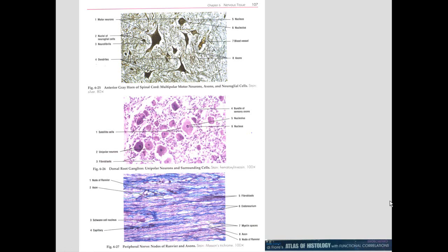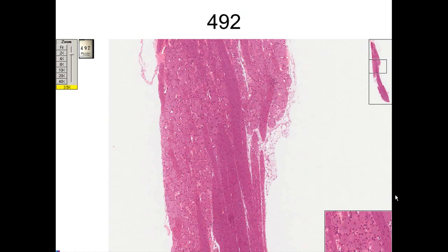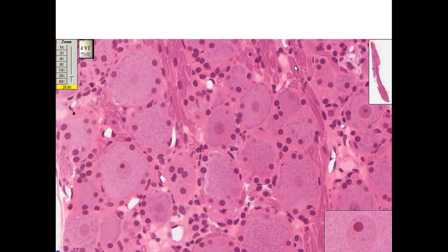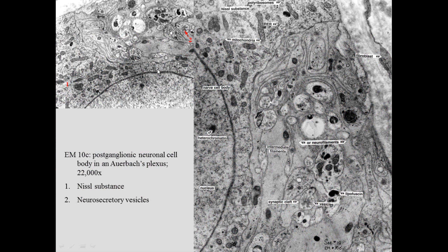Today we'll be talking about the peripheral nerve, but we will also be talking about some ganglion cells. Here on slide 492 we see nerve cell bodies — you can see the nerve cell bodies and myelinated axons running through here. You can see the myelin on either side, these are the cell bodies, and you can see the nucleus, the Nissl substance, and the support cells around it.